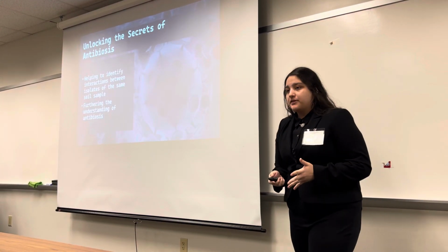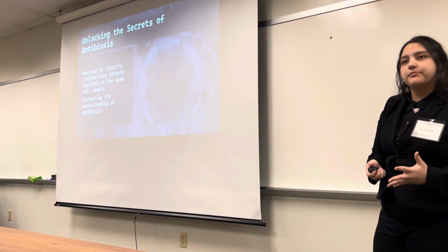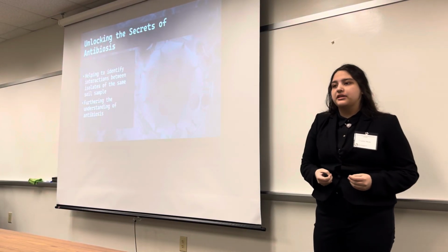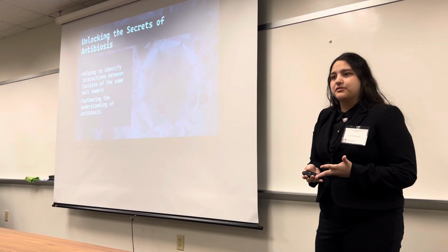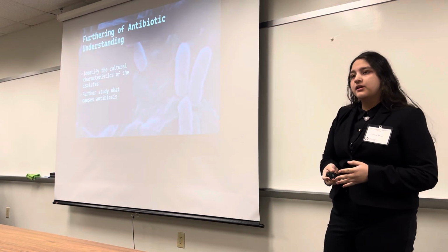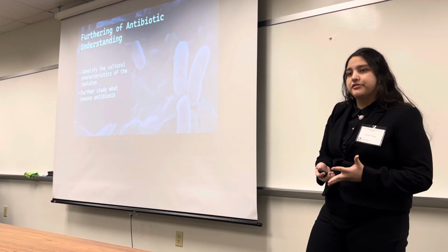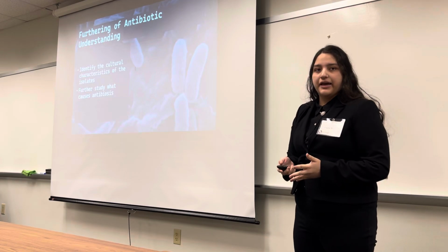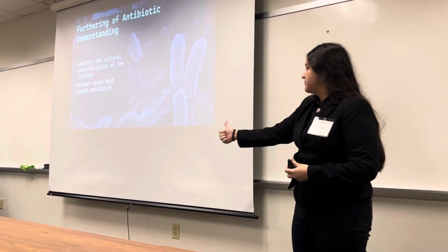The significance of this experiment was to help identify interactions between microorganisms of the same soil sample and to further the understanding of antibiosis, as we still don't know the reasoning why antibiosis truly happens. And for further research, I would like to know what causes antibiosis, as well as what the cultural characteristics of these isolates are, as I don't know what these isolates are just yet, and I don't know whether they are a known antibiotic or a new one.